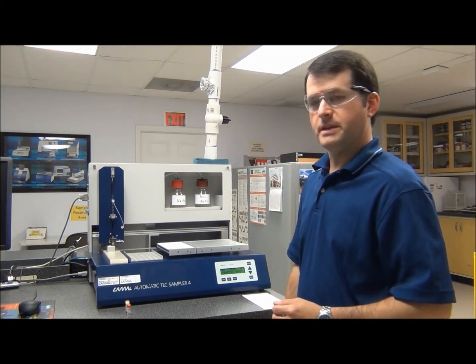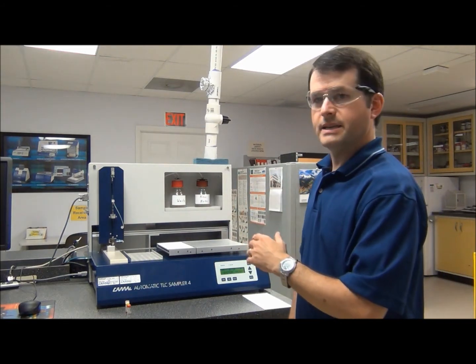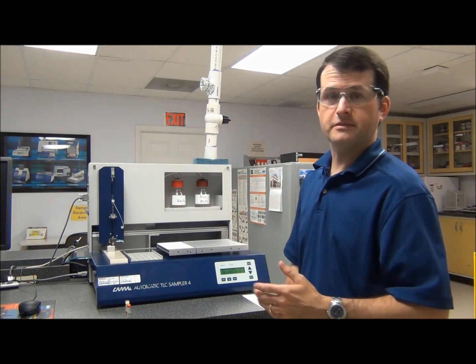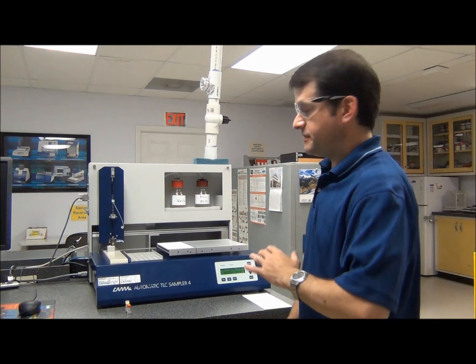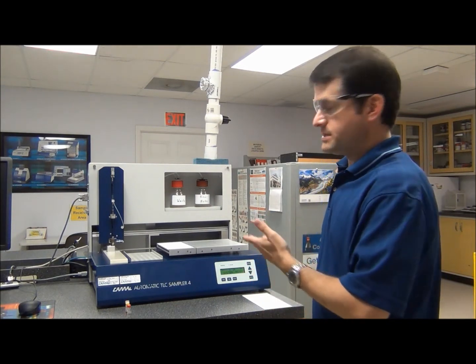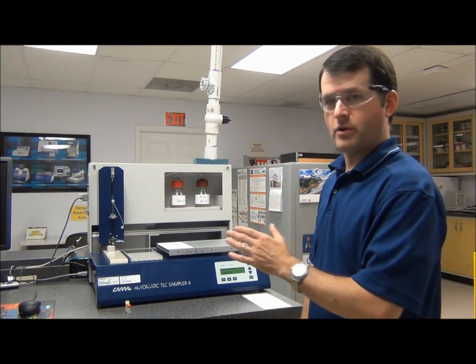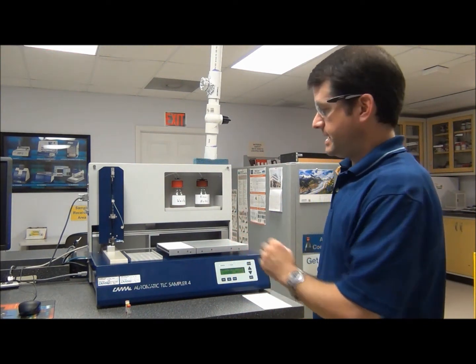The next step in the process is going to be to apply samples to our HP TLC plate using the Automatic TLC Sampler 4, or ATS-4. This is a fully automated sampler that will allow you to apply your samples and rinse the syringe. You basically program it from the software, set it up, and then it will do everything else automatically.